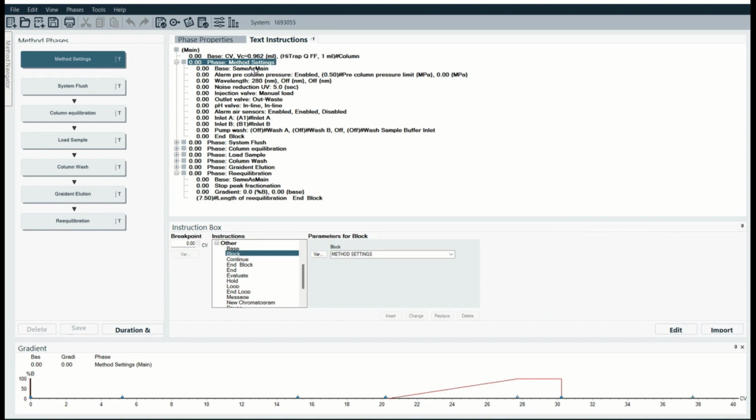If it doesn't, I will come back with corrections, then show you what those corrections are, and then further, I will also post the final method that works in the comment section below, so you can go through those and print it out and type it into your own system and have everything the way you need it. No copyright or anything like that on my part.